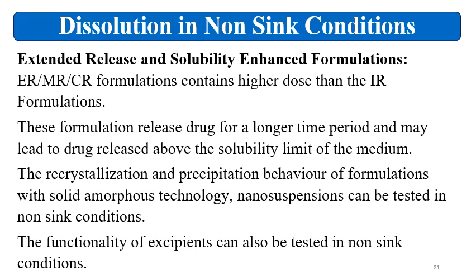Then for some of the extended release formulations and the solubility enhanced formulations, the sink conditions are very difficult to achieve. And sometimes the non-sink conditions can give a good understanding about the formulation performance.